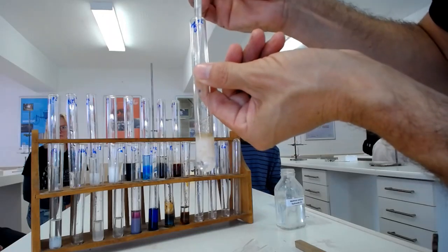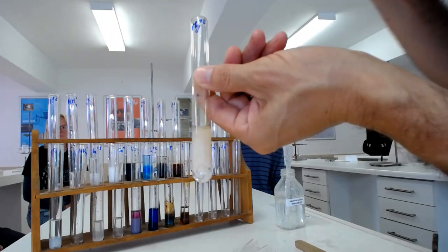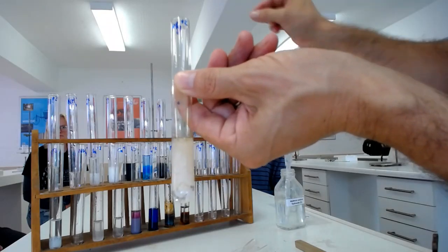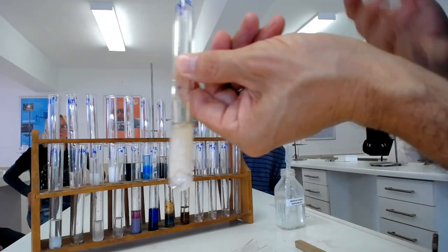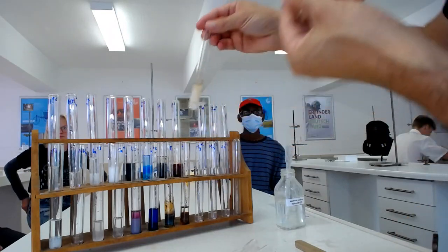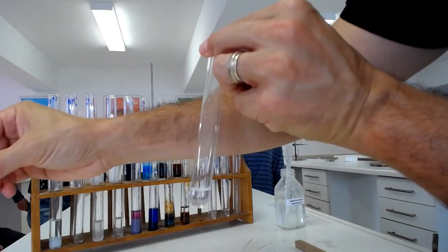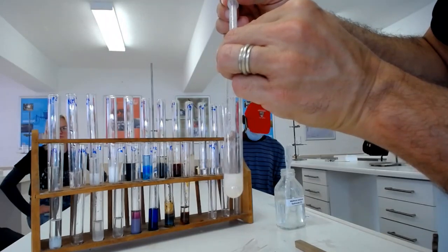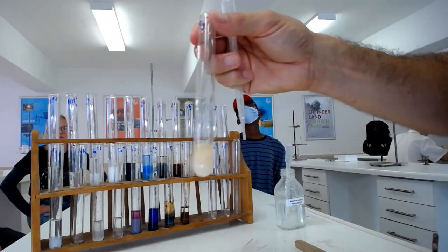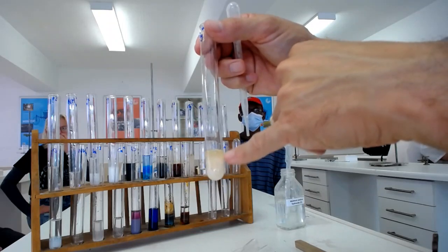So let's try that, because this is what you should do always to confirm the test. Always a few drops and then an excess. If there's no change, then you write no change. You actually get a mark for saying no change, if there's really no change. What about Fe2+ with ammonia? What happens? Same thing. Oh, immediately. But it's even quicker turning brown, isn't it? So that's that brown.